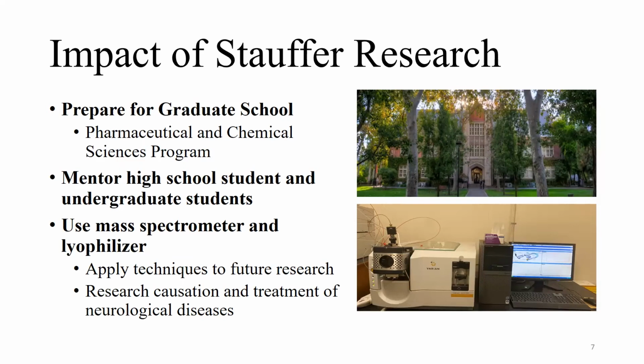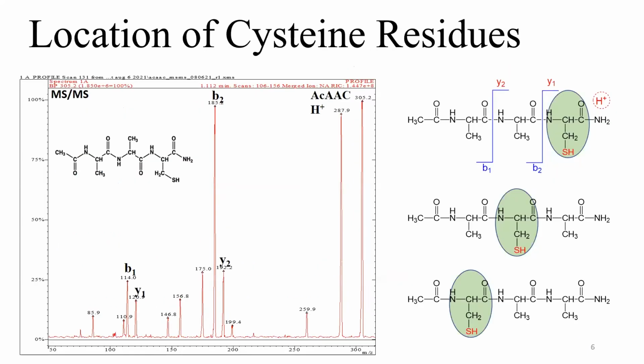I was talking about the mass spectrum. When you're analyzing your peptides, you mentioned the sulfur could be in many different places, and you saw that the B and Y ions have different masses. So why do the B and Y ions break at that bond? Why is that the place that it breaks? There are different points of fragmentation, and there are other ions besides the B and Y ions. We decided to look at the B and Y ions that fragment in these exact places.